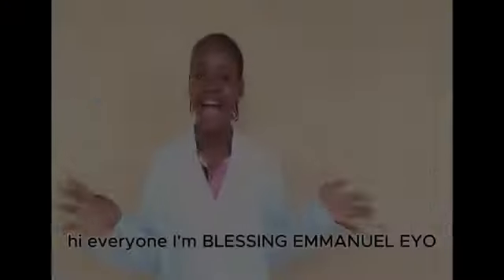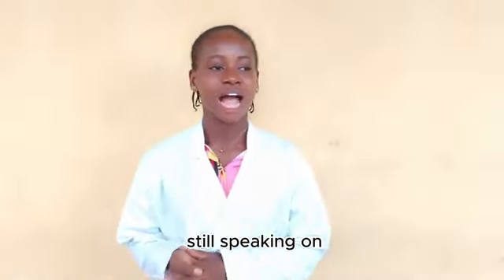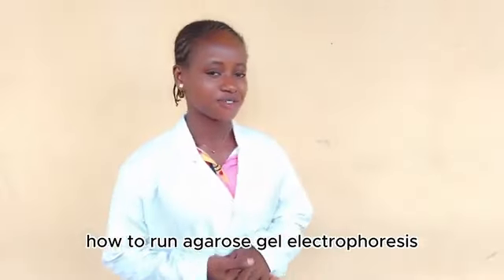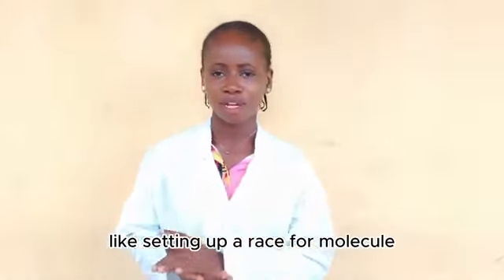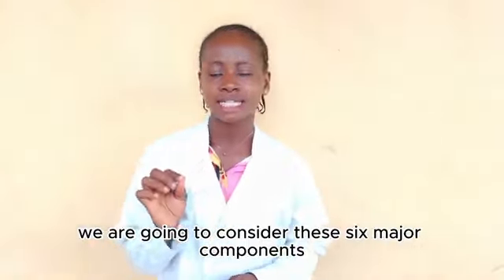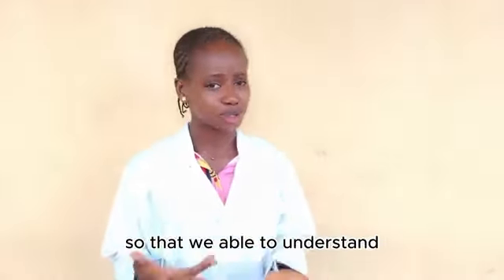Hi everyone, I'm Blessing Emmanuel, still speaking on how to run agarose gel electrophoresis. Now think of it this way, like setting up a race for molecules. We are going to consider these 6 major components. I'm going to group them into 3 so that we're able to understand.